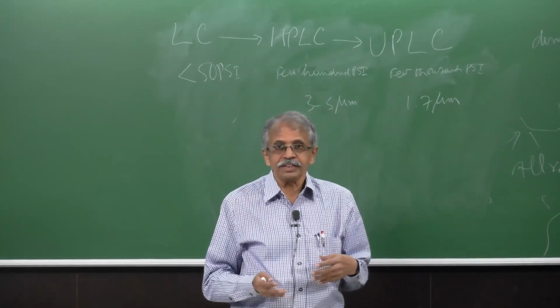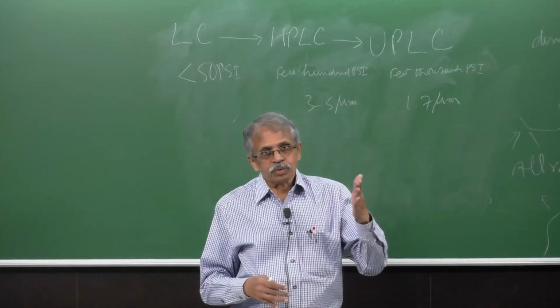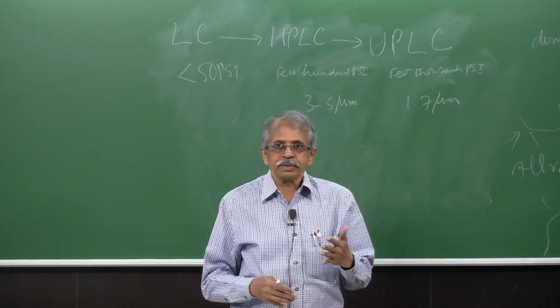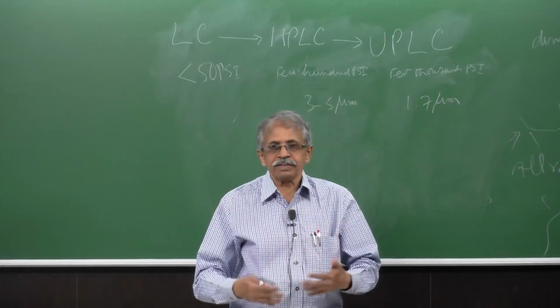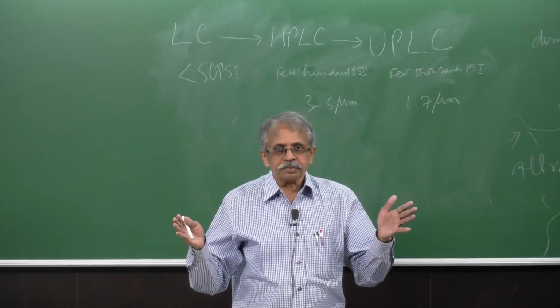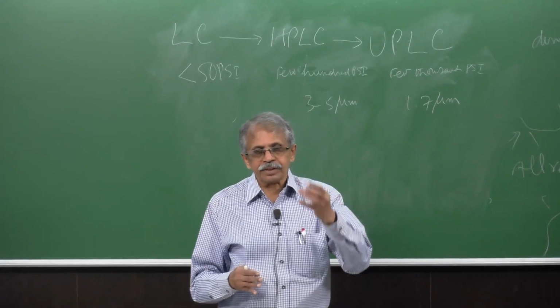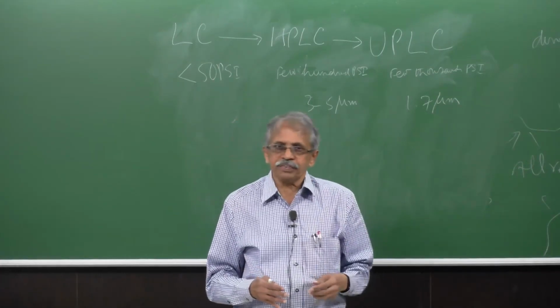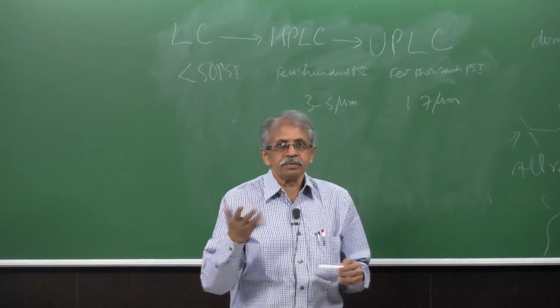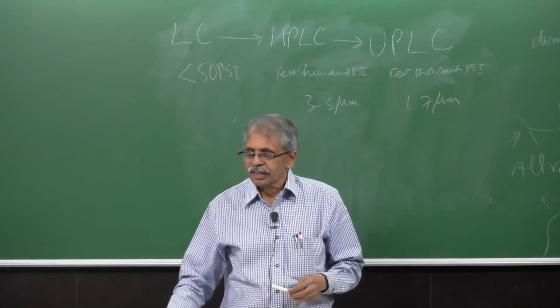Obviously, these are all different. So, time gain is also important, so that you can do more samples in a given time, along with sensitivity and separation, meaning resolution. These are the 3 major things at play in chromatography, and if you understand these 3, you can have your own startup and make profits out of that.